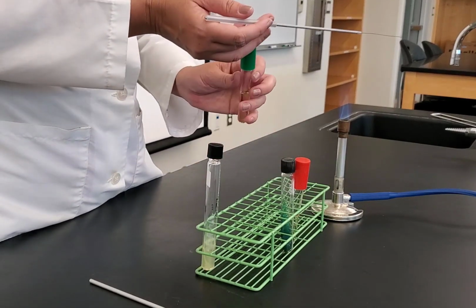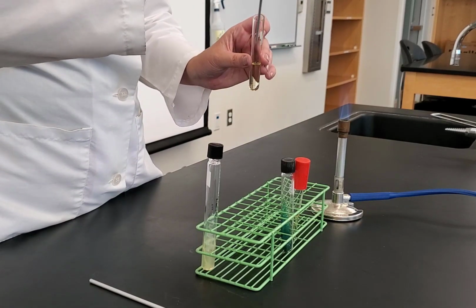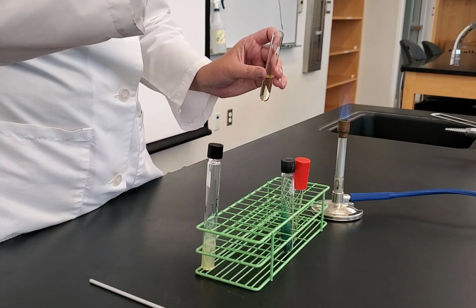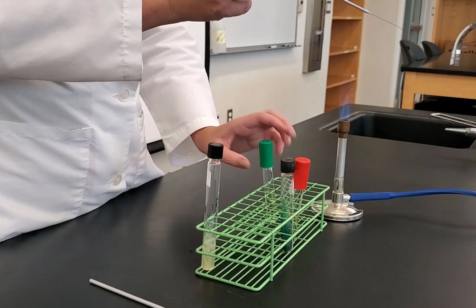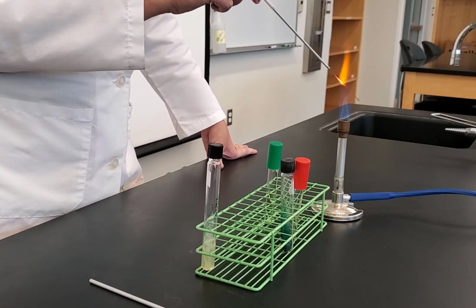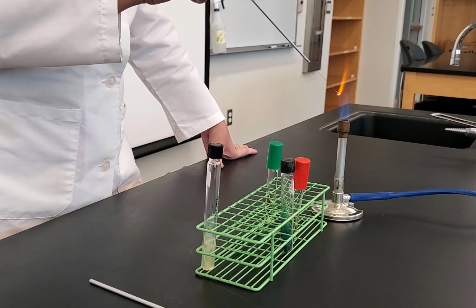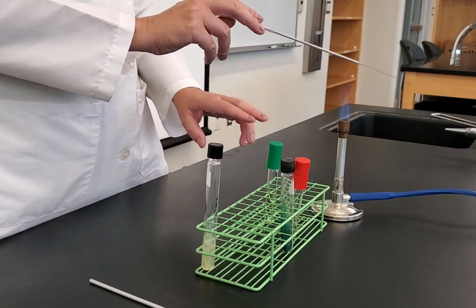I'm going to inoculate my indole first. Flame it, just swirl my loop in the broth. Flame it, cap back on. I'm going to move it in my rack so that I know that that's inoculated. I'm going to flame sterilize in between my tubes. So before I go back into my slant, I'm going to flame sterilize and let it cool.